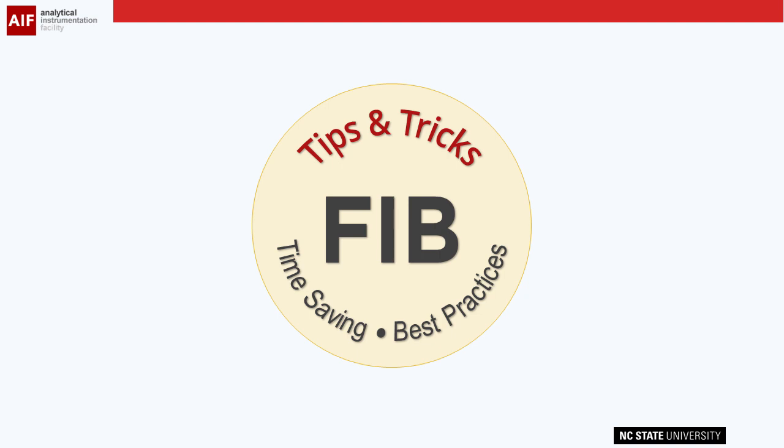Hello, my name is Roberto Garcia, and I'm the Focused Ion Beam Lab Manager at the Analytical Instrumentation Facility, or AIF, at NC State University. Today, I want to talk to you about how to use the FIB more efficiently.